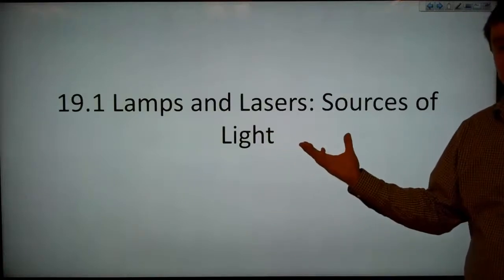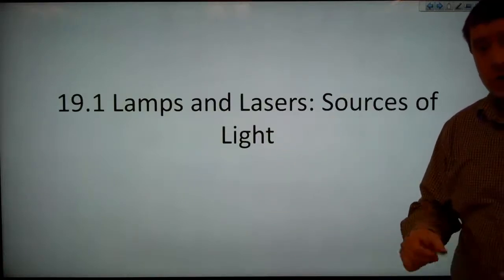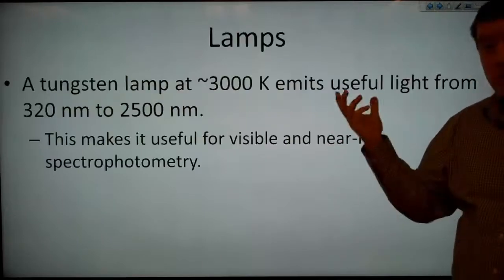Welcome to lamps and lasers. These are the sources of light that we're going to use for our spectrophotometers. So let's start with lamps.